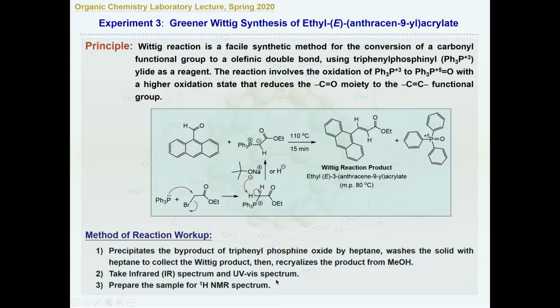The other is the UV visible. Once you link the double bond here, you have an extension, as I indicated earlier, of the conjugation with the push and the pull function. So the optical absorption of UV will shift from about 300 nanometer to 380 nanometer, or even to 400 nanometer. You can see a red shift to the longer wavelength because of the extended conjugation.